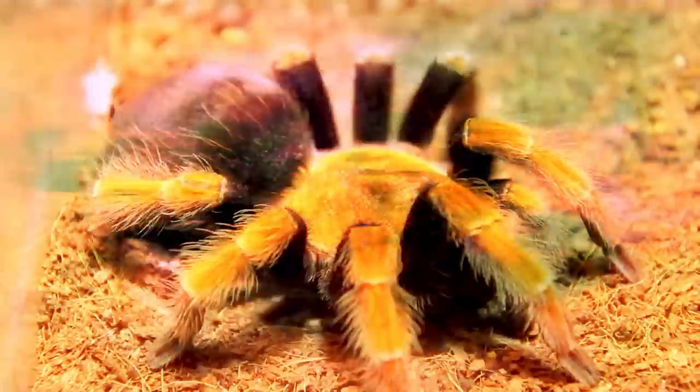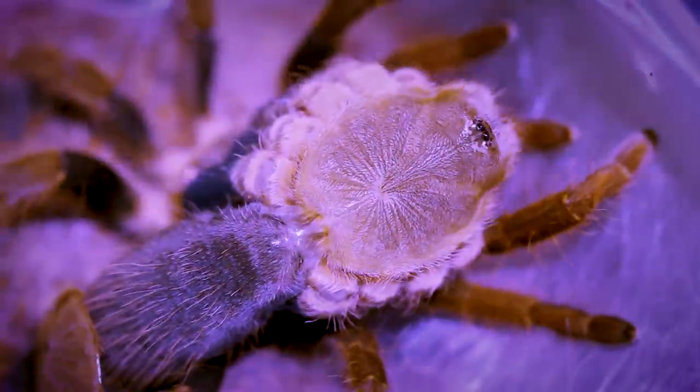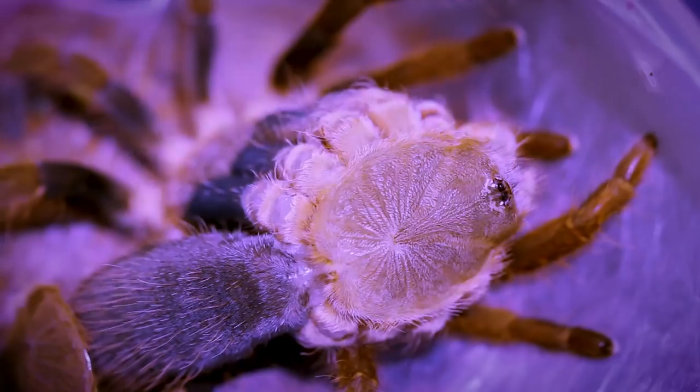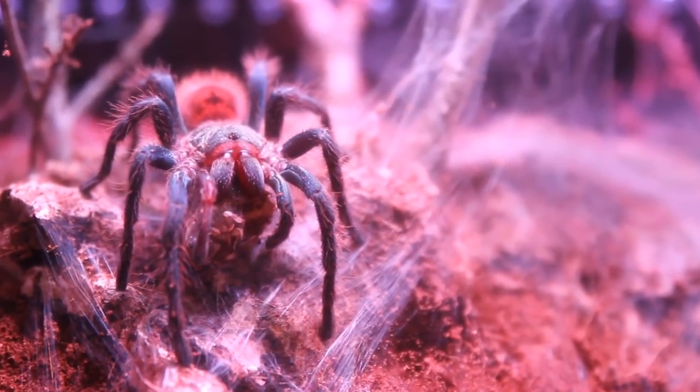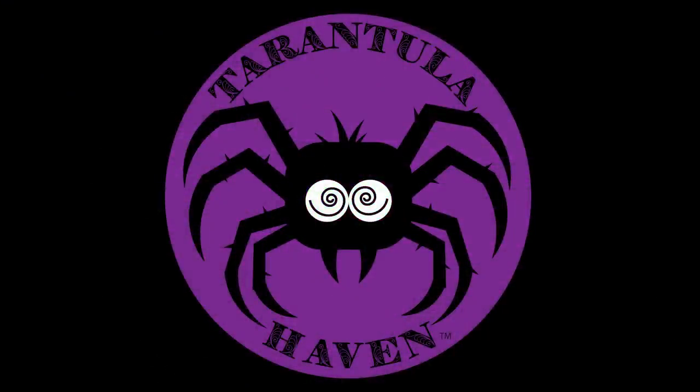Shall we play a game? Let's look at some tarantula private parts. Hello tarantula lovers, I'm Alex and you're watching Tarantula Haven. If you're a tarantula collector, I'm going to show you why you need to invest in a microscope now.